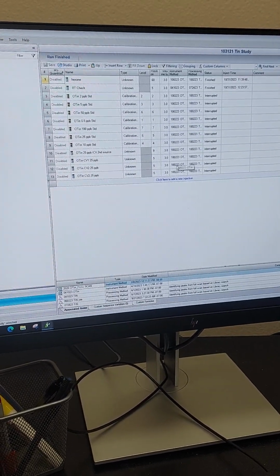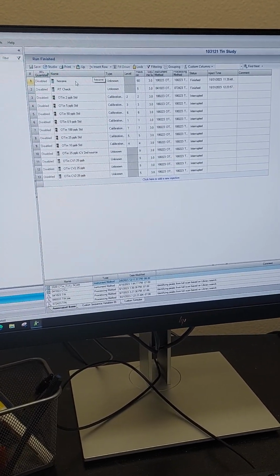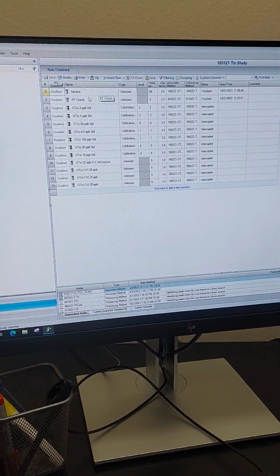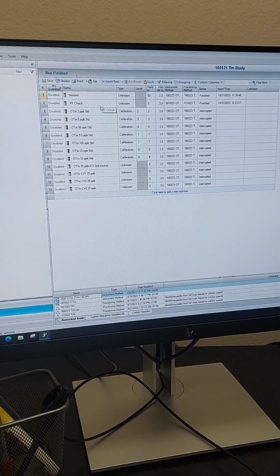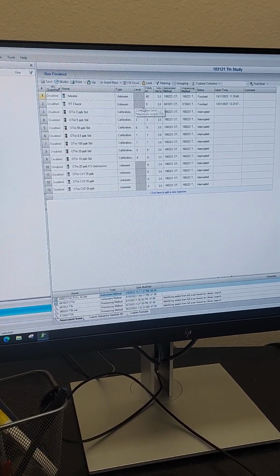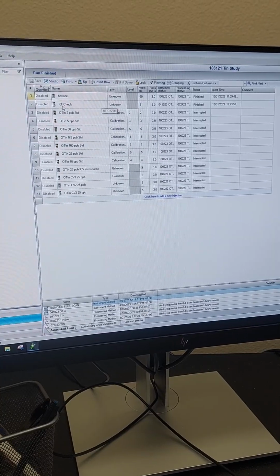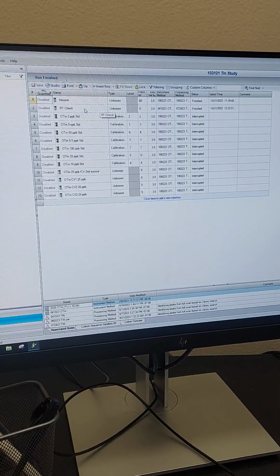So this is what we have. I did maintenance and then I ran this hexane and then I also ran the retention time run check. Hexane every time at the beginning? I don't think they usually do, but I just did it to be extra cautious. So this one just finished running. It's the standard 5. We're gonna use that because we shortened the column, so we gotta see the new retention times. So that's what that one's for.